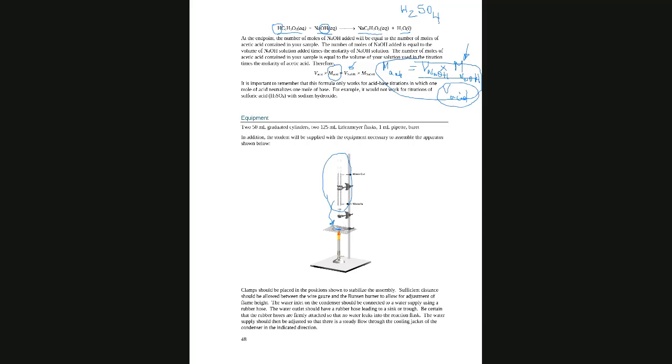So why do we need this technique? We can heat the reaction because the reaction takes an hour and a half until it reaches equilibrium. If we don't put the condenser, everything is going to evaporate, because the organic solvents and compounds are sometimes volatile. So in order to be able to heat a reaction for an hour or an hour and a half, we need to use this technique of refluxing.